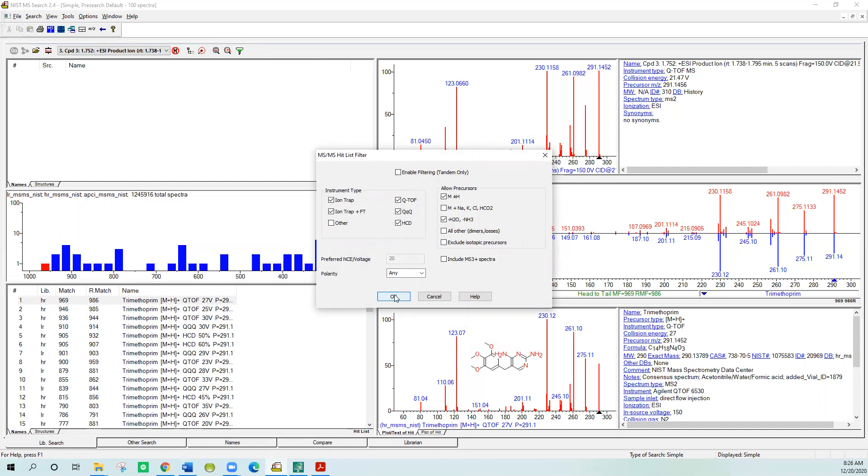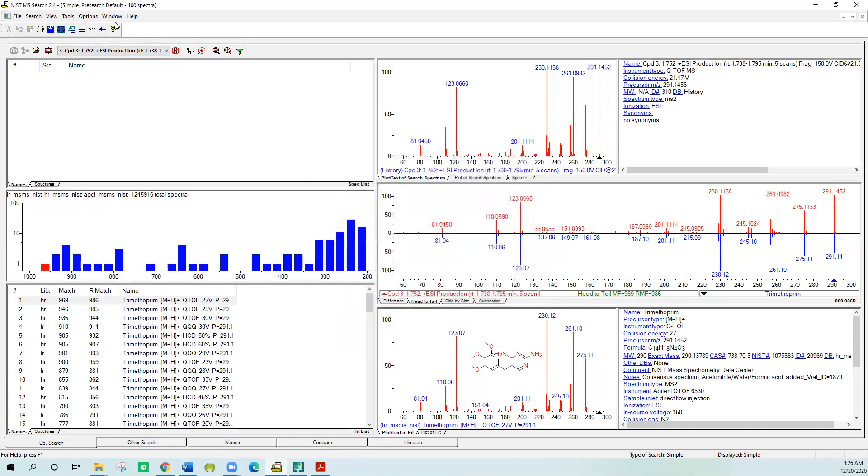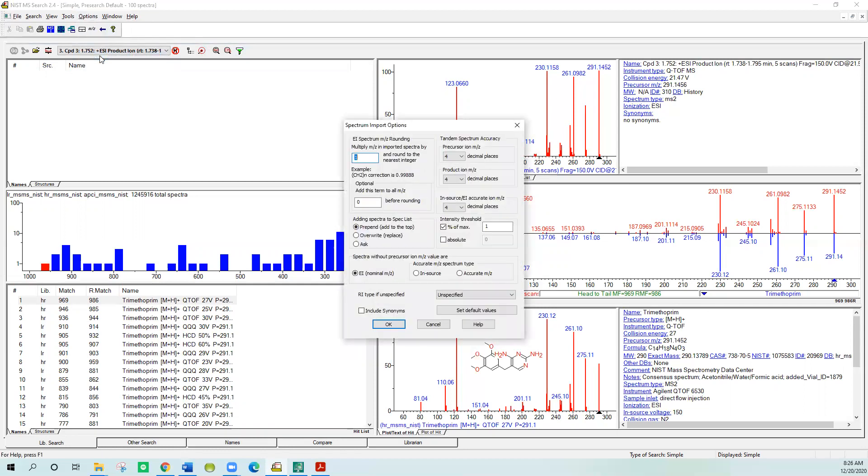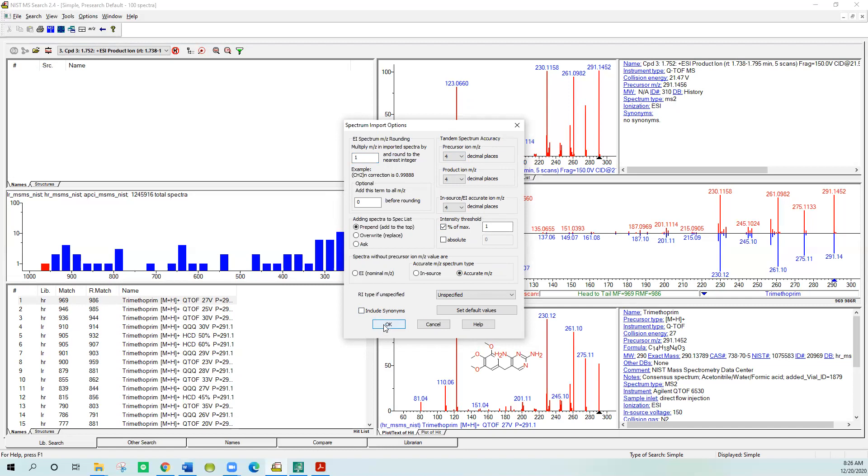One other option that you might want to take a look at is the spectrum import options. Every spectrum that's brought in is run through this filter. You can put the number of decimal places. If you have noise, this could be very handy. You can get rid of the percent of maximum, so if you have a noisy spectra or a group of noisy spectra, you can get rid of some of the small ions automatically as they come in. And we want to select the accurate mass to charge for bringing in the data, since all the data that I'll be showing today from the MassHunter is accurate mass.